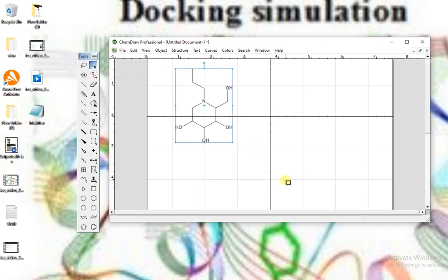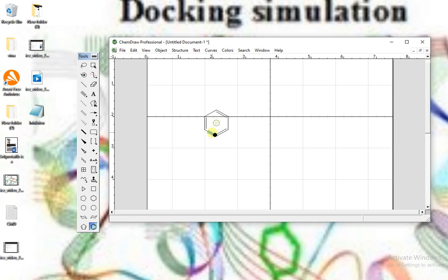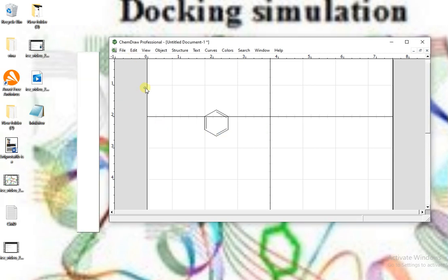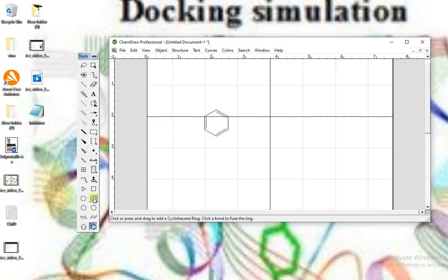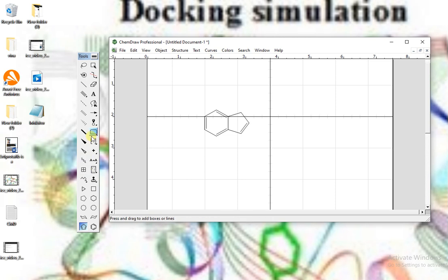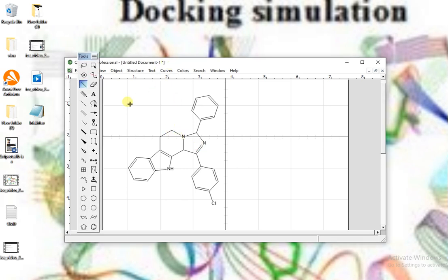Now I draw the structure of the compound that we have synthesized. This is the structure of my synthesized compound. I simply copy the structure.